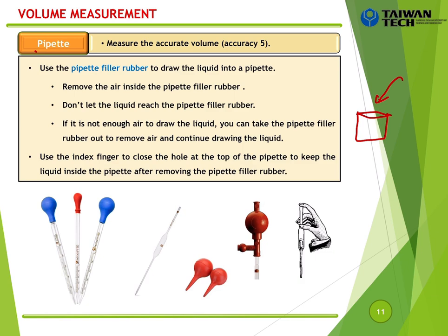And if you have the graduated cylinder, something like this, then you use the beaker, or maybe the bottle, to add to here, but I suggest you use the beaker to add the chemical into this one, because the beaker has a large opening, easy for you to add the chemical from the bottle, but this one is very small, it's not easy. So you add to here, and you can add from here to here, very easy.